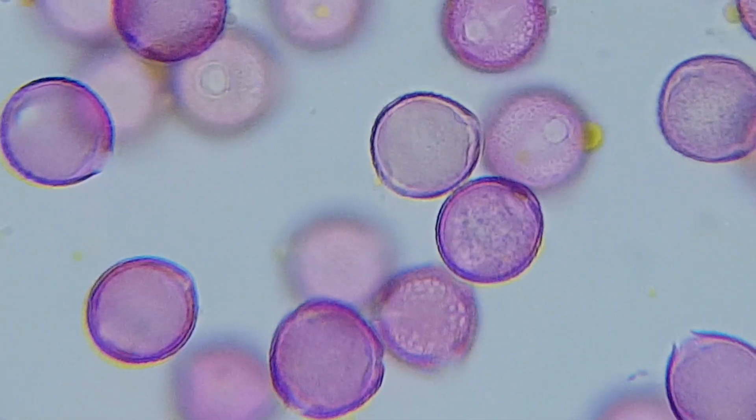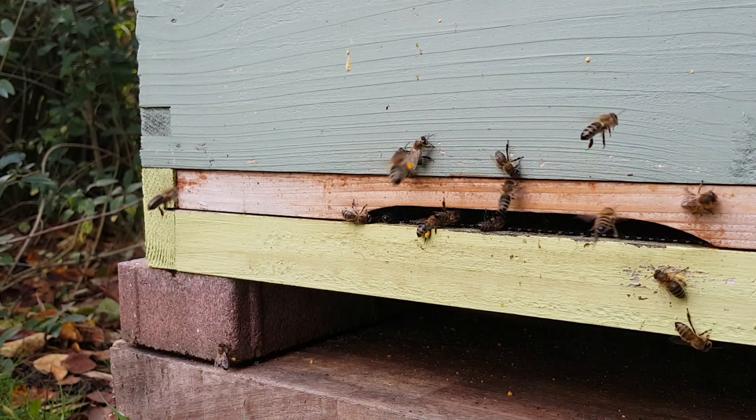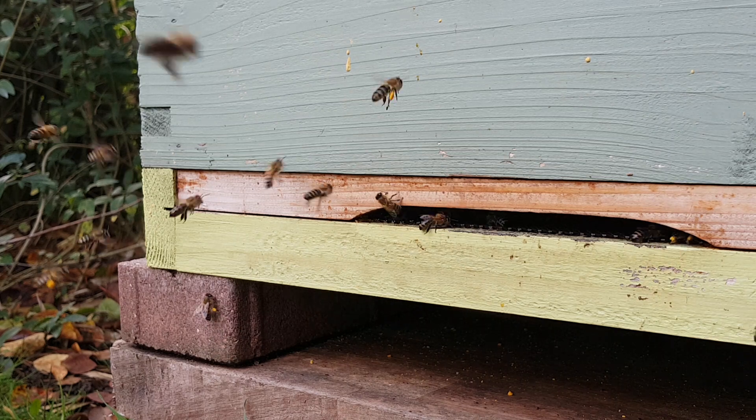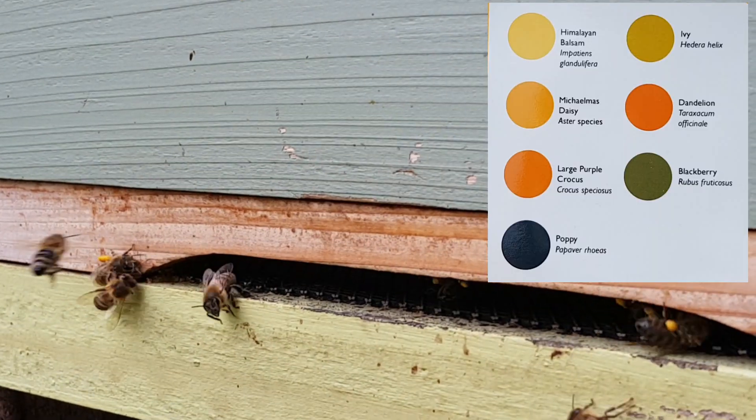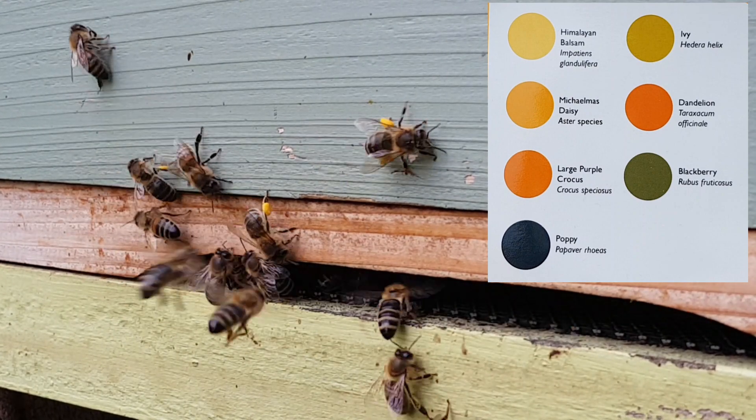So looking at the same footage from earlier, did you guess the pollen load by going on the colour chart alone? And would you still choose the same colour now you know it's ivy?